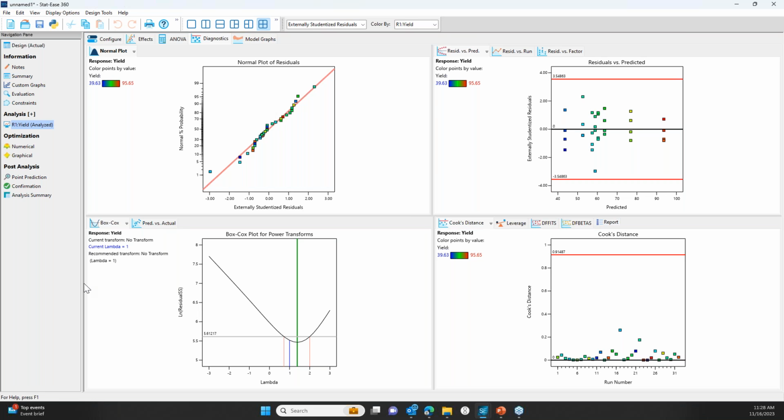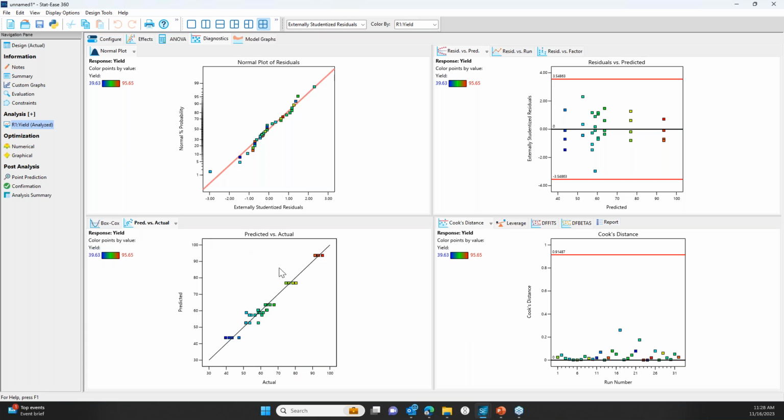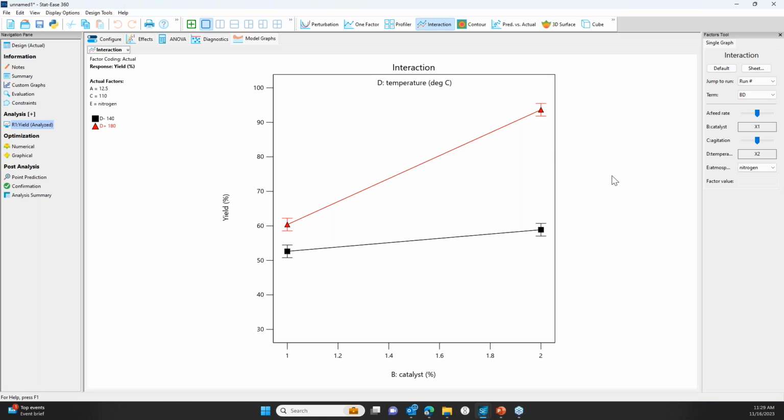They should be normally distributed. Well, this graph highlights that. We should have residual versus predicted with some properties that are okay. Inside the red lines, no big megaphone. So there's a bunch of different things that we're looking for on these diagnostic plots that we won't have time to cover in detail today, but these all look solid. They look good. So then we're going to come to the model graphics.